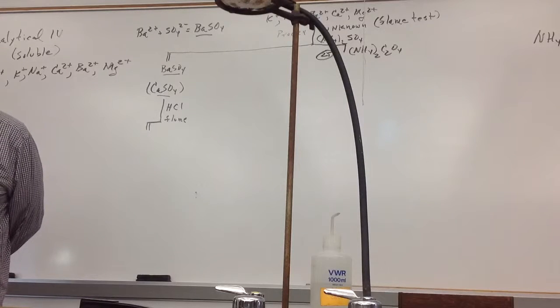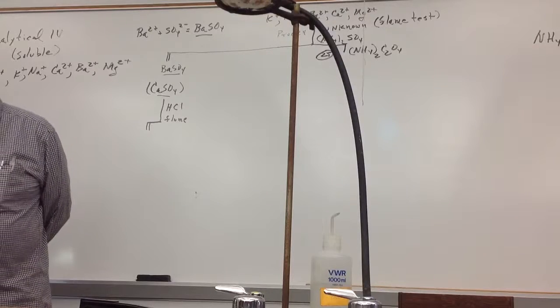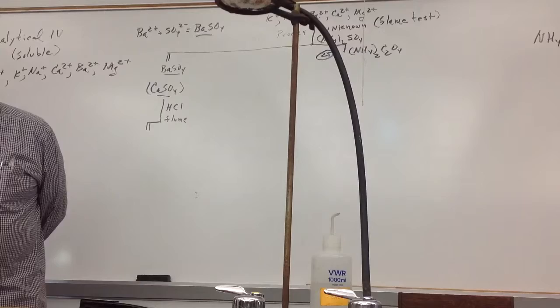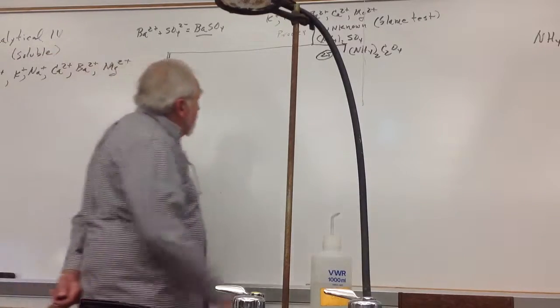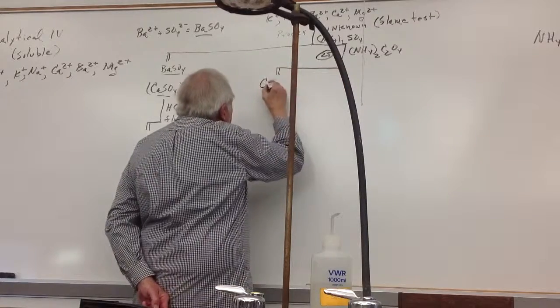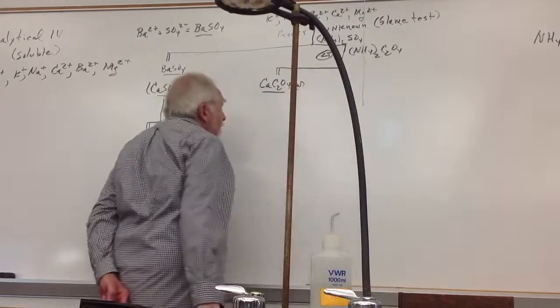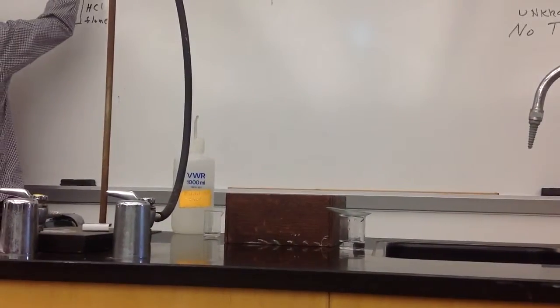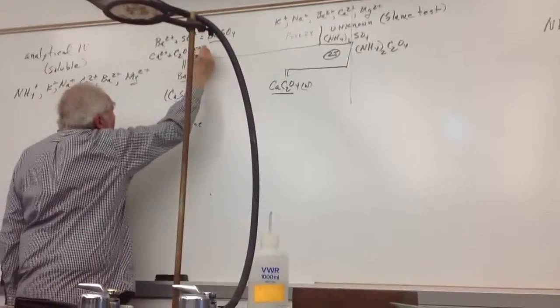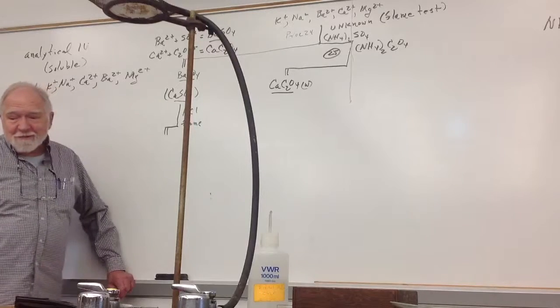So if it's acidic, you add, it says test the solution initially. If it's acidic, you add dilute or 5 molar ammonia until it is slightly basic. Again, you're doing it drop by drop. Okay. Then you add this thing, basic solution. Another white precipitate. And another really easy ionic equation. All you have to do is know the difference between Ba and Ca.